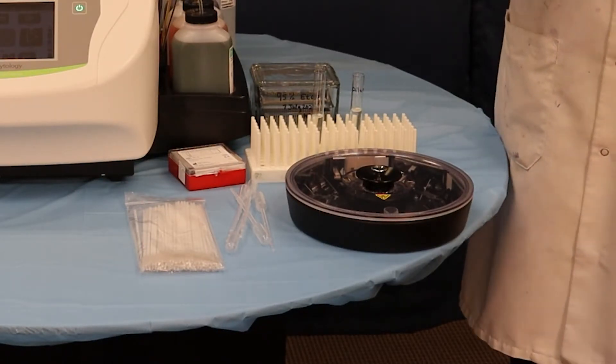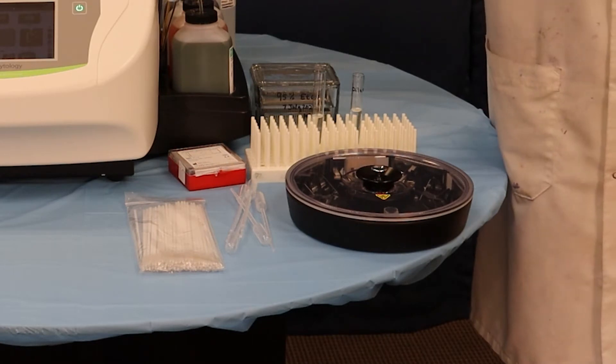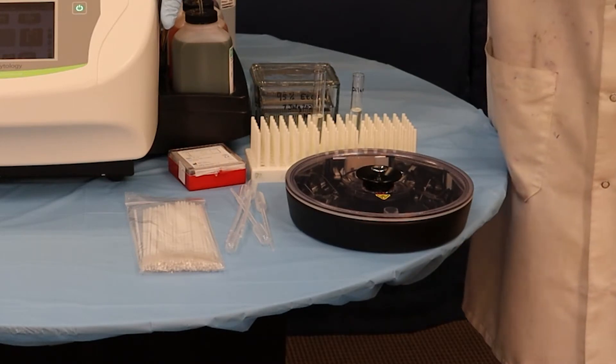Today we're going to demonstrate how to mount buccal cells. The AeroSpray Cytology Stainer has a dual purpose — it can be used to stain, but also to be used with our Cytopro Rotor to cytocentrifuge cells onto slides.